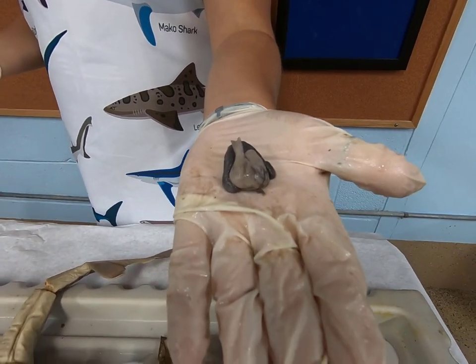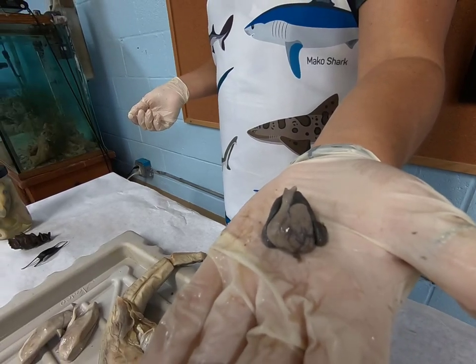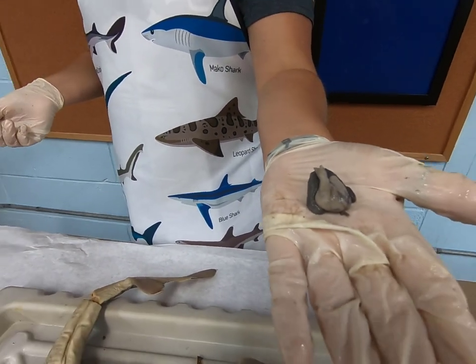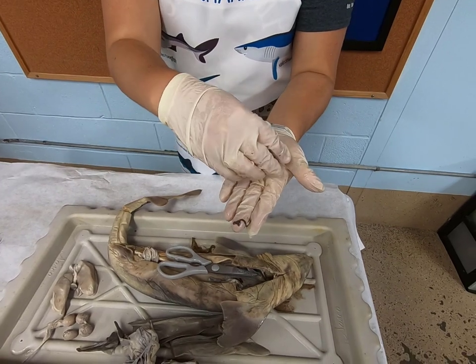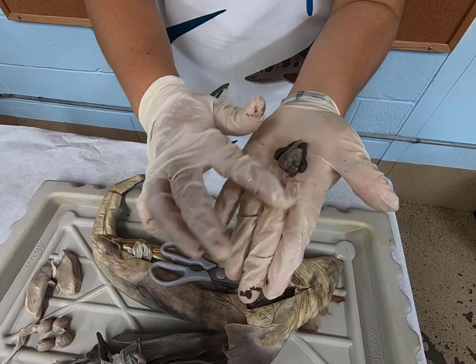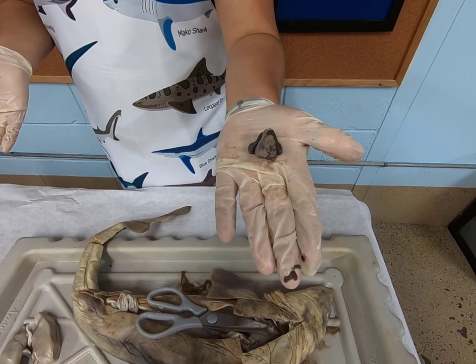It's pretty small. Their heart isn't quite working as hard as ours to get oxygen all throughout their body. They don't quite need as much oxygen as we do in their blood, but they do pump all that. They have their heart and their two chambers here, and that back sac is their conus arteriosus. It's not a true chamber, but it does help with moving that oxygen to the shark's body.